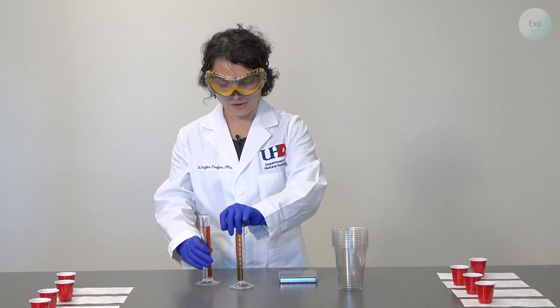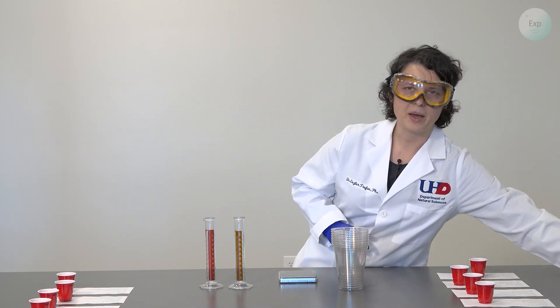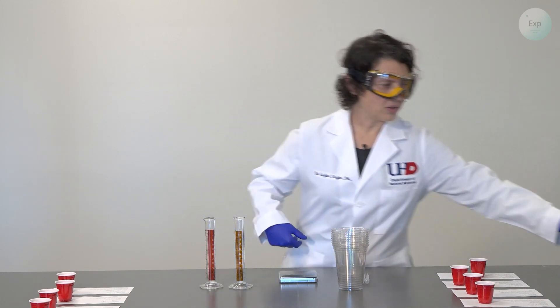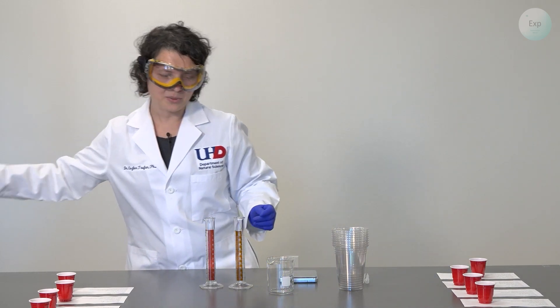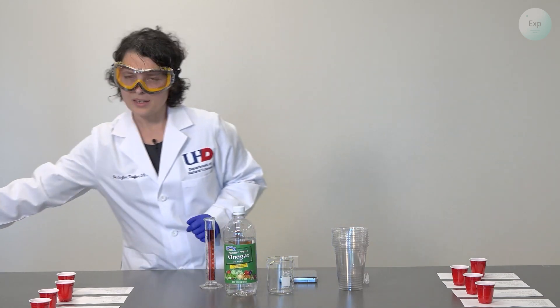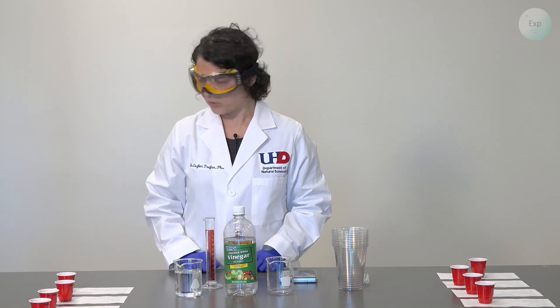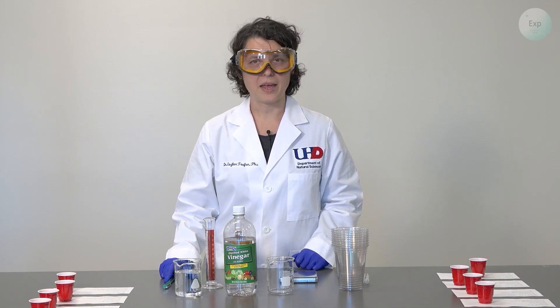If we want to be very exact in our measurements, we may want to use two pipettes — one for water and one for vinegar. I'm also going to bring in a beaker so that I'm not pouring from my original 5% vinegar container, and I'm going to use some deionized water already poured into a beaker. Finally, because I'm going to record everything, I will need a pen.